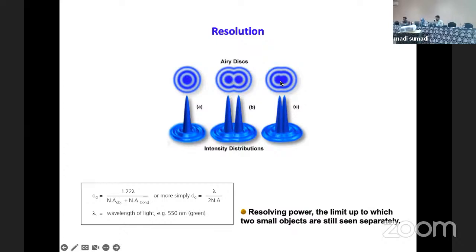And this is exactly the main technical problem between the confocal microscope and a super resolution microscope. Confocal microscopy is very beautiful, you can have nice images, but if the two particles or the two structures you are looking at are less than 350 nanometers apart, you cannot distinguish them as two separate structures. And this is also an artifact, not an interpretation.